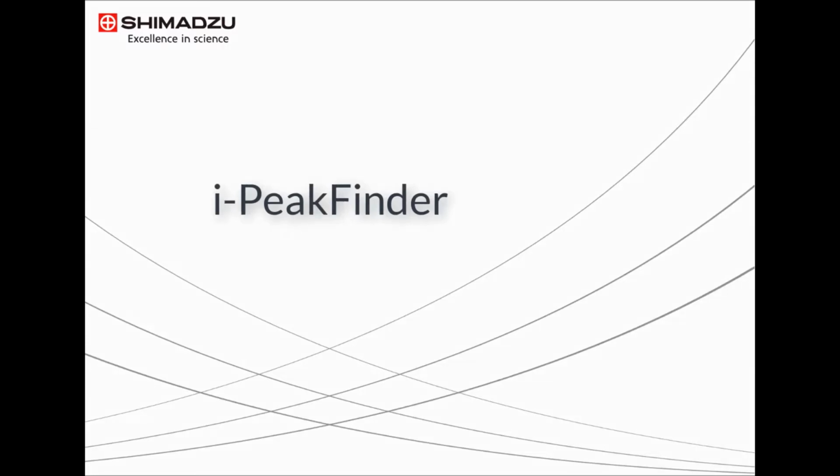Hello and welcome to the i-Peakfinder demonstration of the LabSolutions software. i-Peakfinder is a new and more complex peak picking algorithm when compared to traditional industry algorithms. It's fast, simple to use, and will more intelligently determine the location and areas of peaks in your spectrum.